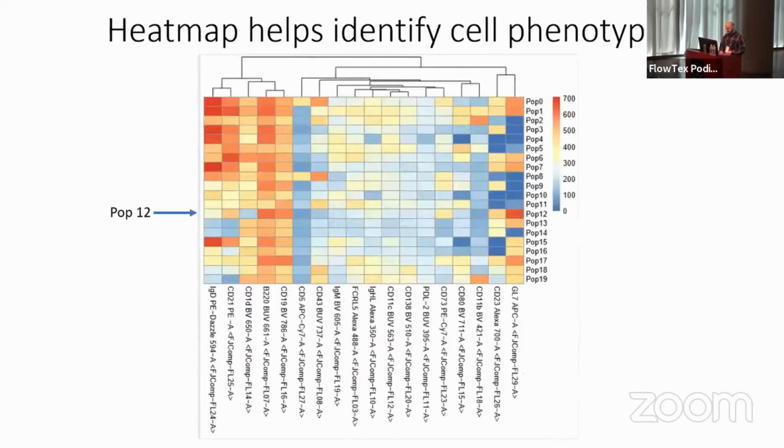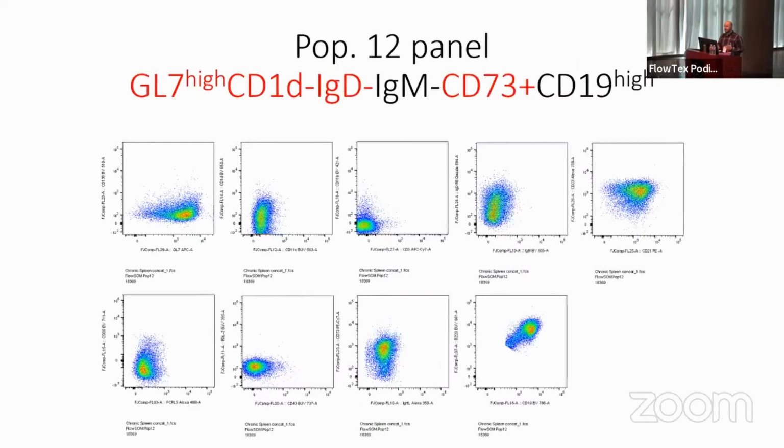And so when I see these heat maps, as flow cytometrists, we don't like to average things. That's kind of against our nature, because we're a single cell analysis platform. So I always take these heat maps and look at all the pairwise plots of these averages. Because sometimes, as people who run these algorithms are probably aware, you don't get beautiful clustering. Not everything's positive, but the heat map might tell you it's positive. You might have a good mix of positives and negatives in there.